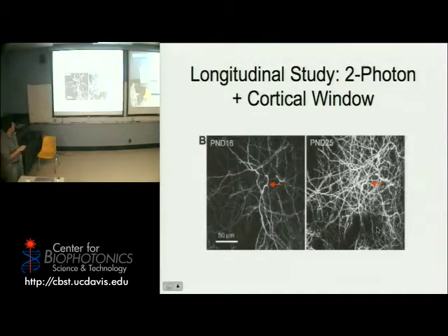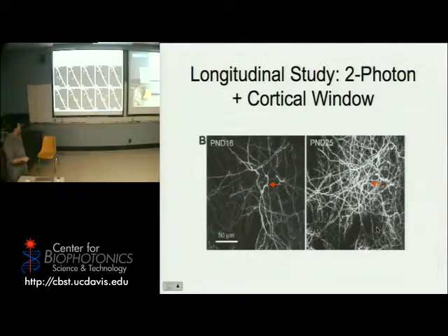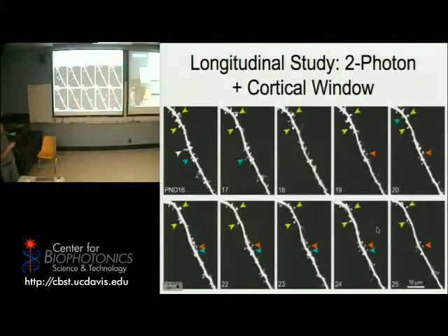What he points out here is you see this little bend right there? So even after all this development of synapses and all this sprouting, he can still identify the same spot. At this spot, he looked for these spine formations, and spines are where the synapses form. This is day 16, this is day 25. He recorded this very same segment every day in vivo, so this is an intact animal.